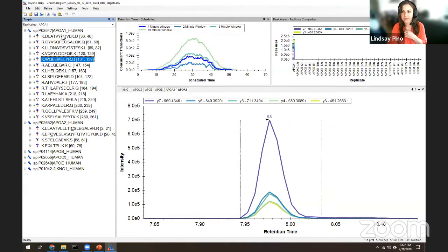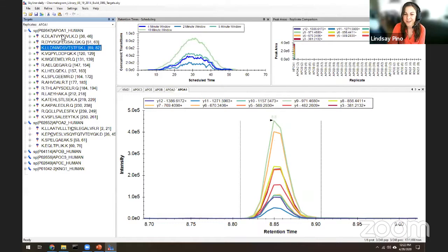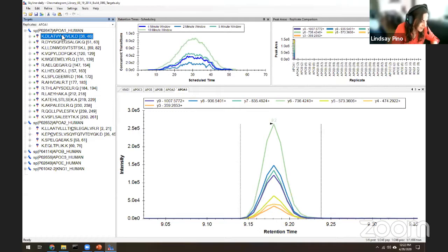Okay, so we've got tons of questions. What I'm going to do is, in these last 5 to 10 minutes, keep my Skyline document up and go through removing precursors that I don't think look as good as others while I answer questions. I will see how good I am at multitasking. Okay. So first I'm going to quickly scan and see if there were questions people had because they were stuck with Skyline. It looks like everyone's doing okay with the Skyline tutorial at least. So I will try to answer as many questions as possible. And if I don't get to your question, feel free to add it to the Google Doc page and I'll answer in line in the Google Doc page.